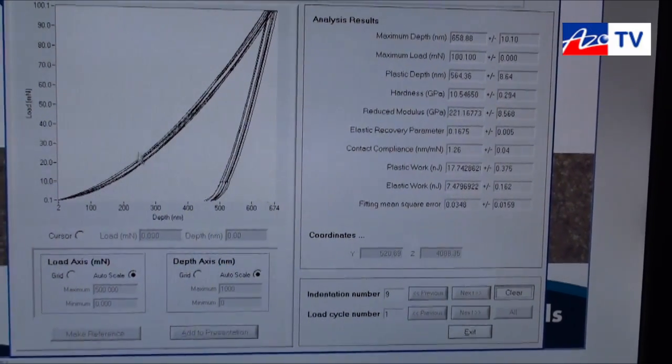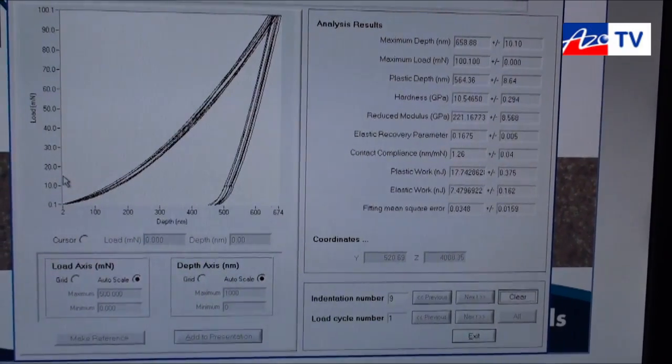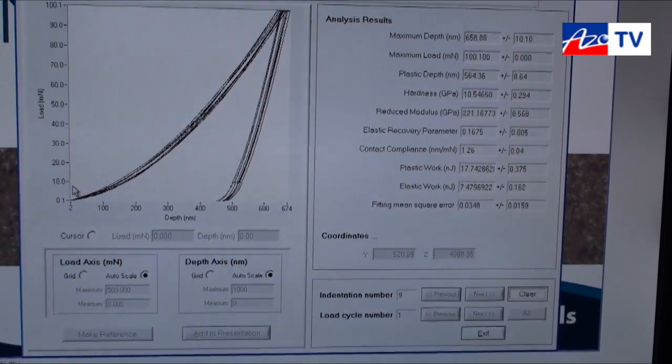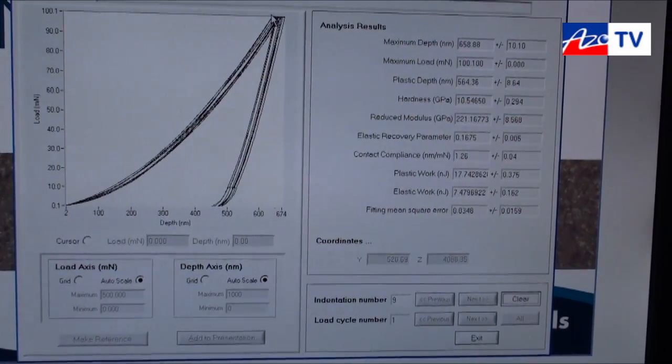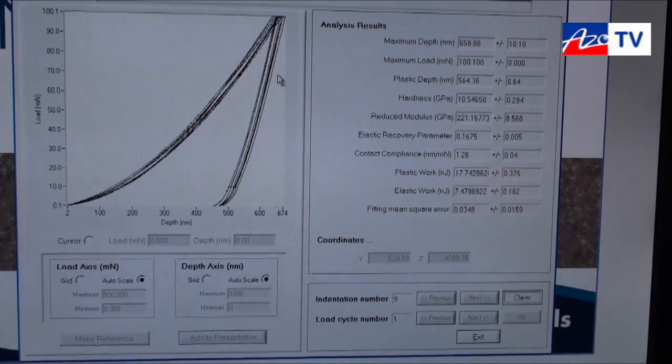You can see here the loading slope in each case is slightly different, and that's a result of the initial contact being different in each case. The actual depth change during the hold and the slope of the unloading data is the same in each case.